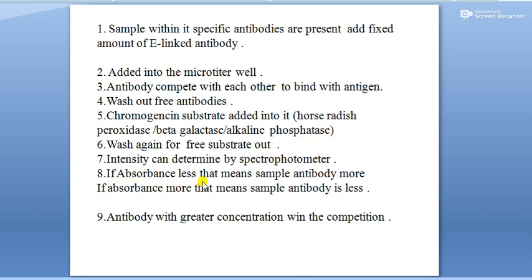Next, if absorbance is less, that means the sample antibody is more. If absorbance is more, that means the sample antibody is less. Obviously, the antigen linked antibody which is linked with an enzyme binds with the substrate and they get the product.